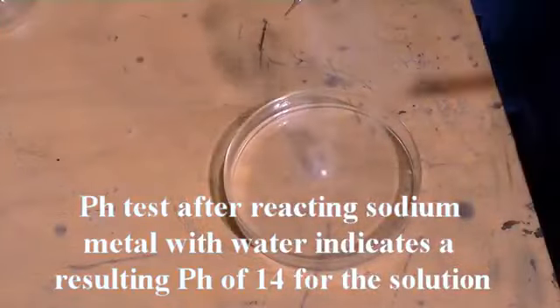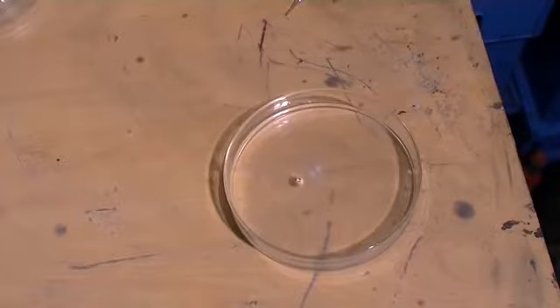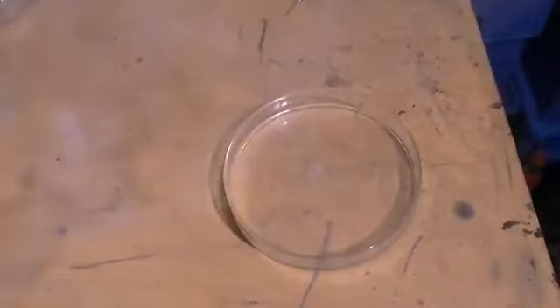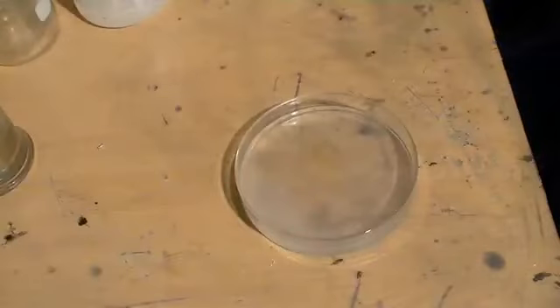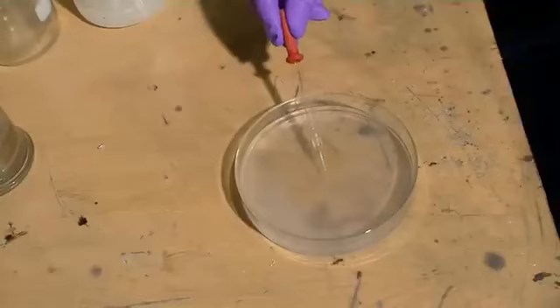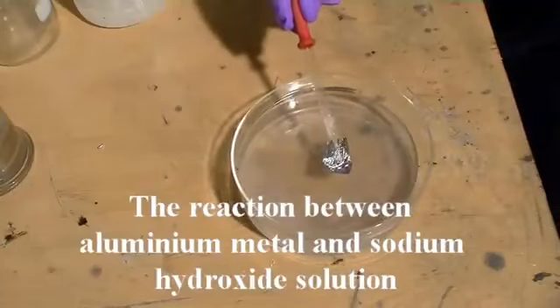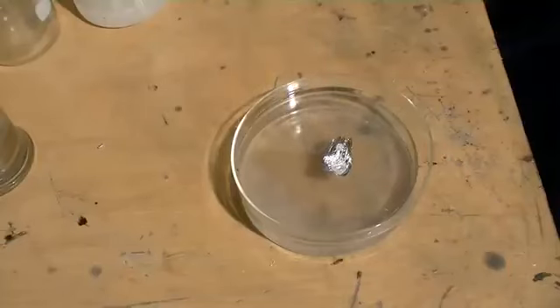Let's put a larger piece in and light the hydrogen. See the characteristic yellow flame of sodium? We'll try an even larger piece towards the end of the video. More sodium metal was reacted with the water to form a stronger solution of sodium hydroxide, and now we're going to have a look at some of the chemical characteristics of sodium hydroxide solution.